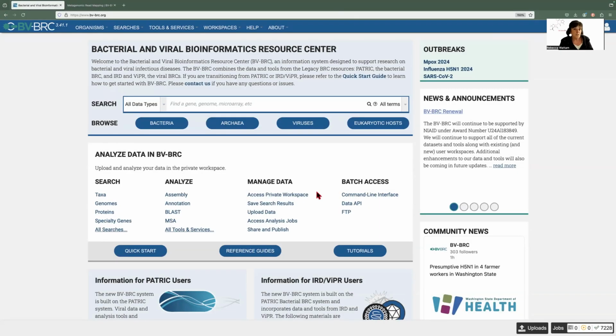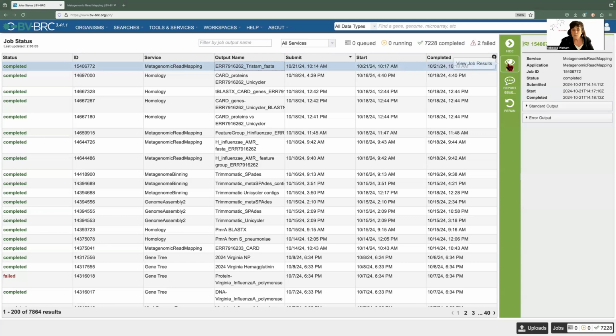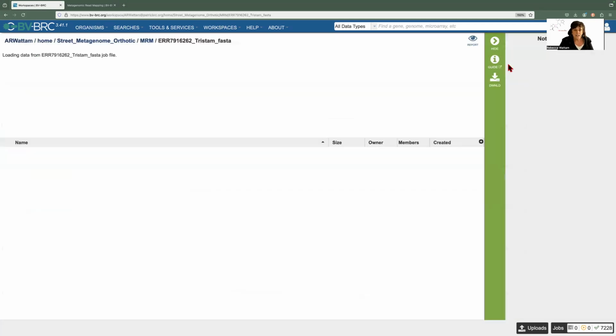Okay, in the first video that looked at the results, we looked at the Metagenomic Read Mapping Report, but there are other files that are generated by this particular service. So in this video, we're going to look at some of those. So I want to go into my jobs report, and I want to click on this one, which is the most recent one I did, and that one used a FASTA file. So I click on this.